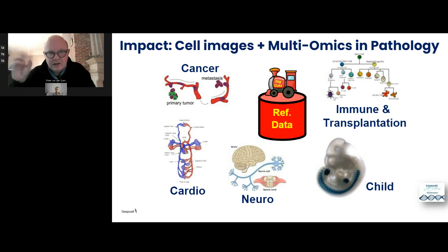And basically, we did another study where we looked at the urine, where we wanted to study a particular type of urothelial cell carcinoma, a cancer. And in that case, you can also see very specific contributions of cell morphology, in experiments that can get incredibly sped up by avoiding having to isolate the cells, pour them in a paraffin block, cut slices, do stainings, then see which cells are positive.